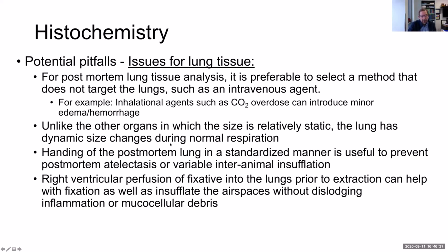Also, unlike other organs, the lung has dynamic size changes during respiration. So how you handle this post-mortem to avoid atelectasis is another consideration to get proper tissue preservation for comparisons. And a common thing is to use right ventricular perfusion of a fixative into the lungs prior to removing them, and also to insufflate the air spaces in some settings. So those are all just things to take into consideration.